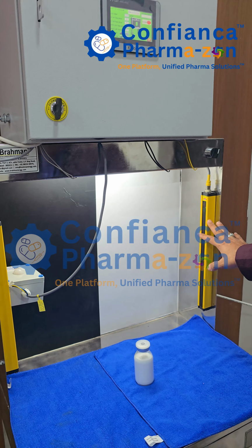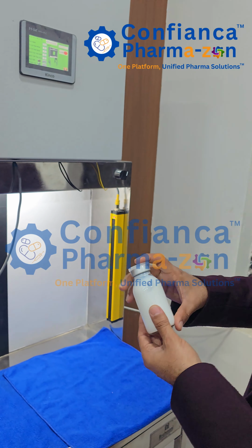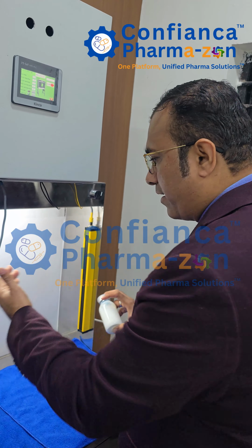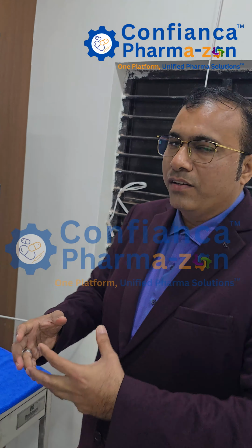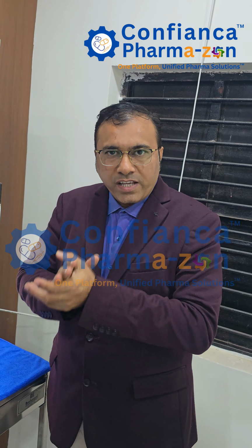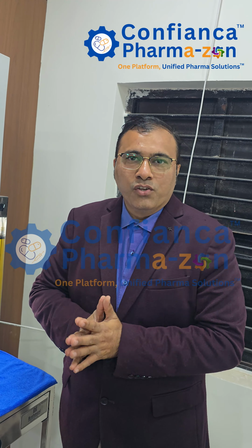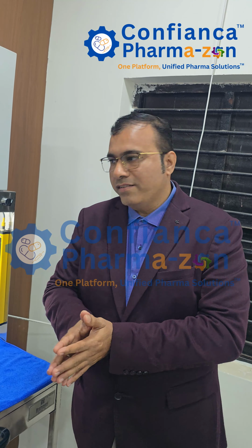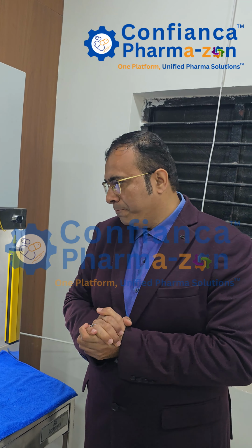These sensors are curtain sensors. If I want to check this vial and I put my hand like this, the sensor rays will cut, and it will start a 5-second timer. As per the guideline, you should check each vial for a minimum of 5 seconds. If you make that compliance, you will get the log in this HMI and PLC.